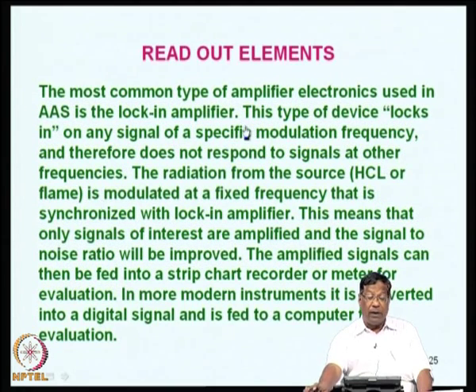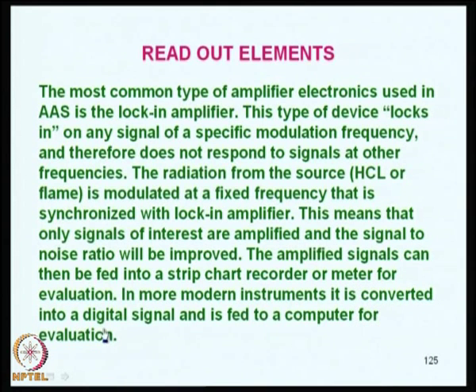So, if we proceed to the readout elements, again we have discussed that lock-in amplifiers have a very important function: to measure the response only at a particular frequency, and this frequency is locked.